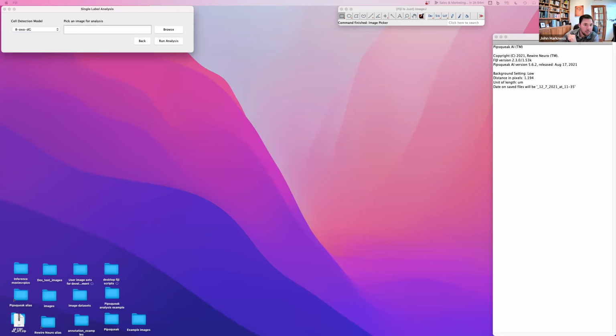Great. So here we've got some really big images. Hang with me here for just a second.